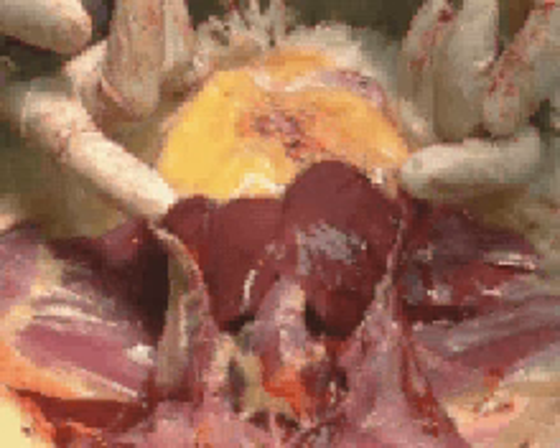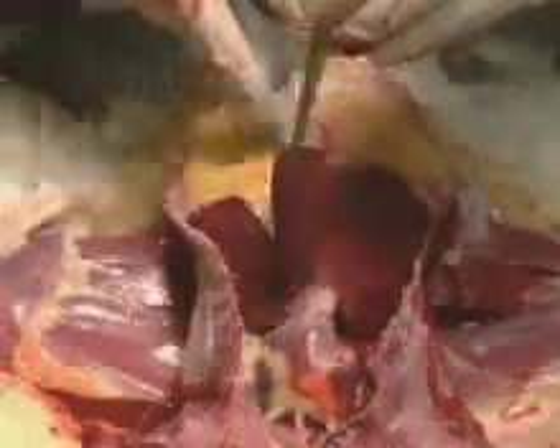This liver is normal in shape and in color. If we were wanting to sample that liver for histopathology or for culture, it could be done in this manner. The liver could be grasped with a forceps, a large piece excised.